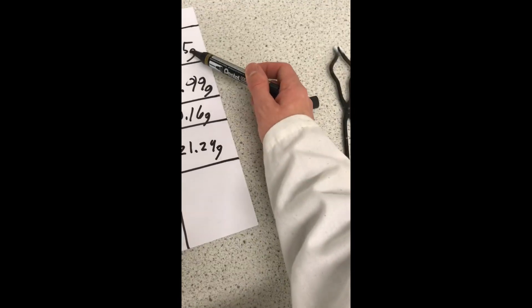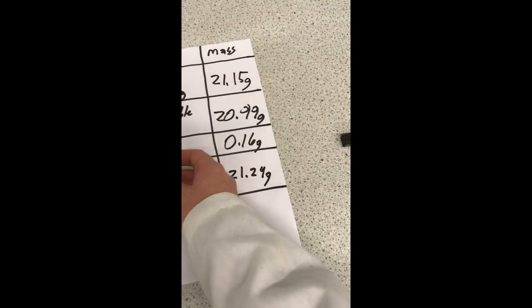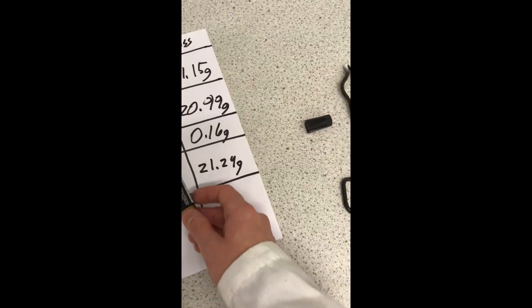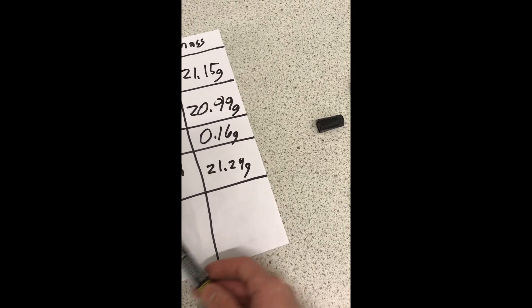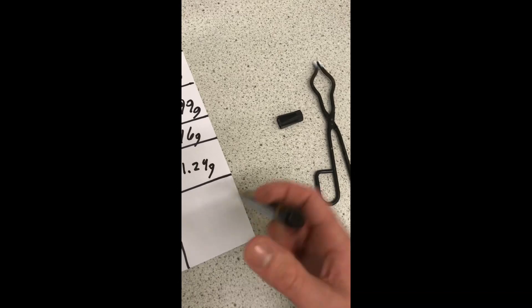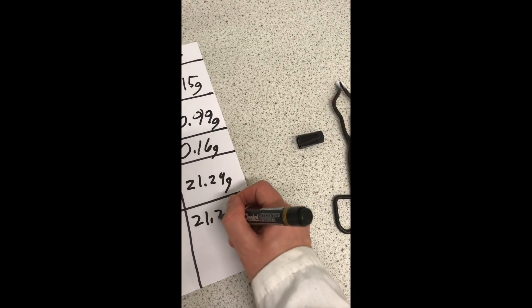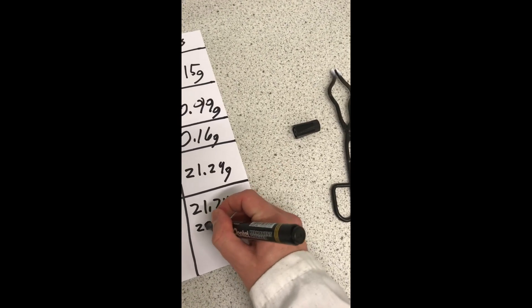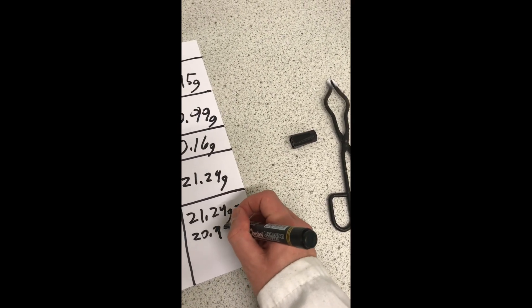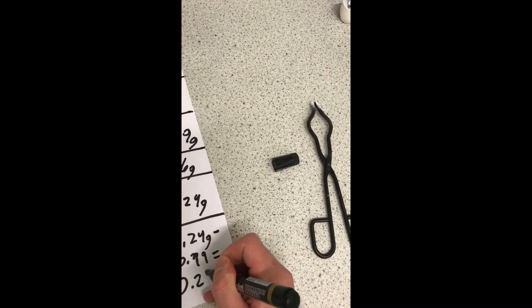Now, the original mass is only 21.15 grams, so if we take the mass of the empty crucible with the lid, and take the crucible with the lid and magnesium oxide, so that will be 21.24 grams, take away 20.99, this will give us exactly 0.25 grams.